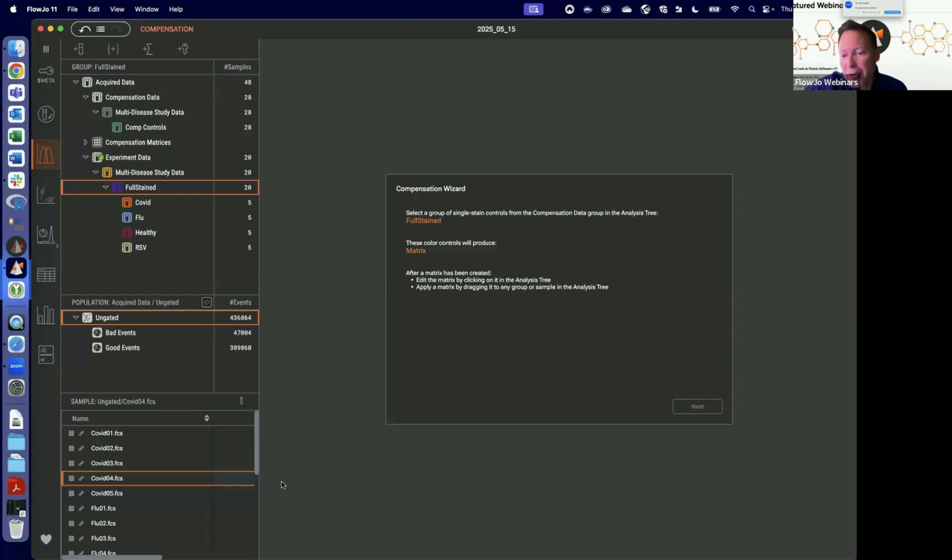If QC fails, that implies there was something inherently wrong with the data. Though the one place that might not be true... a QC should just give you a result, and even if most of the events were bad, you should see a result. The one place where you might not see a QC result at all, or it might just plain fail, is if the data file you're using does not have a time parameter. We run into it occasionally, where time is recorded, but the name is something we couldn't figure out was time. There's a few cytometers that use odd names that are not just time. I think we've tried to get them all, but that's the thing to look at.